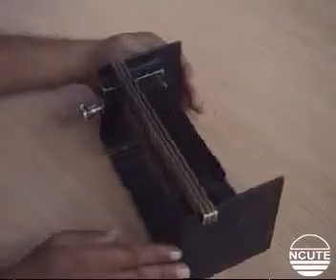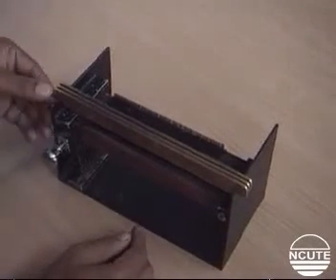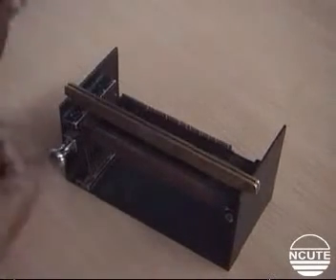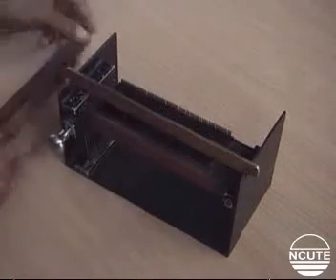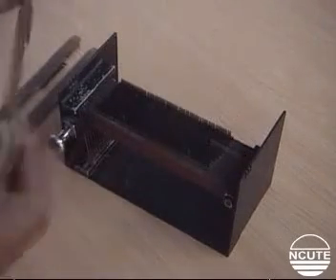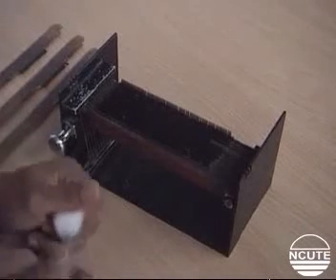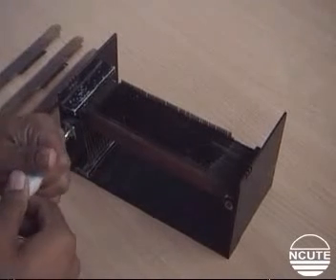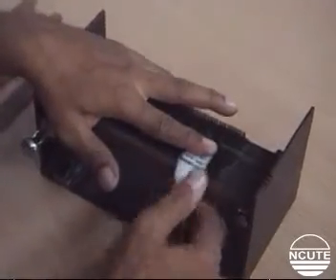Next, turn the instrument around as shown so its backside faces the operator and lift the top combs away from the bottom combs. Now place the fiber tuft on the bottom combs at the right hand side as shown and press it down gently using the depressor.